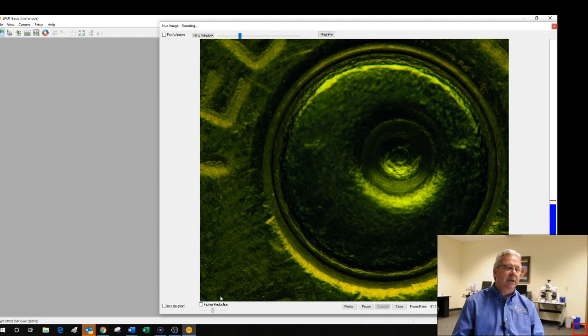At any rate, there's a little button down here in the lower left corner of my live screen that says flicker reduction. And when you click on that, hopefully that should now give you an image with more constant or homogeneous illumination. There is a button there that you can slide back and forth if it's not balancing out all of that brightness change.